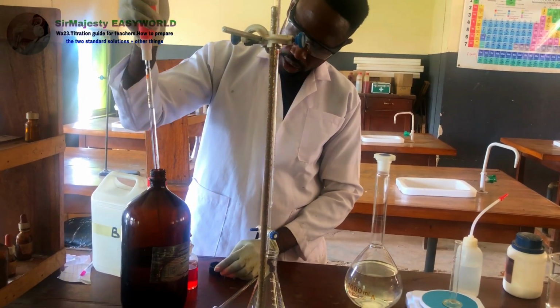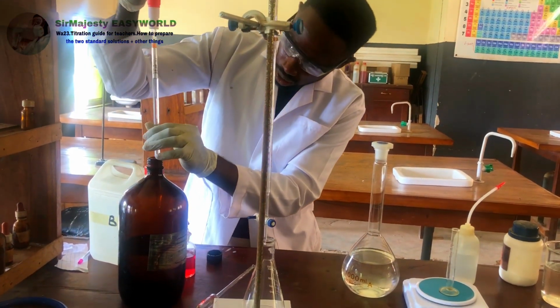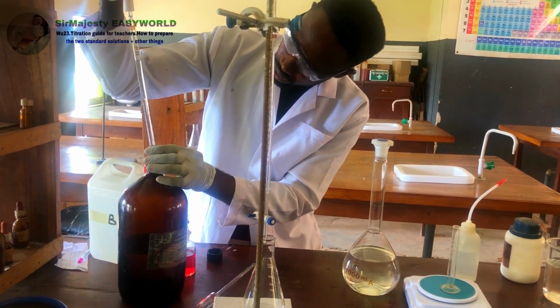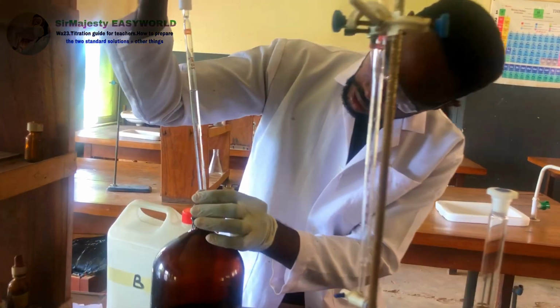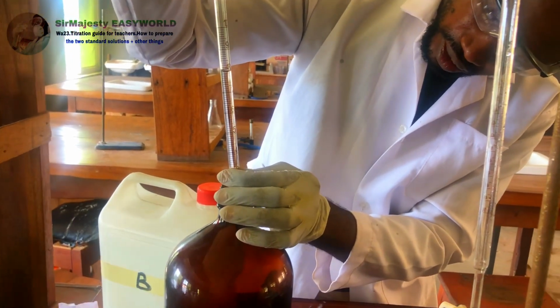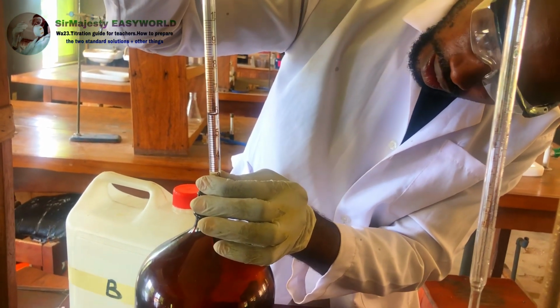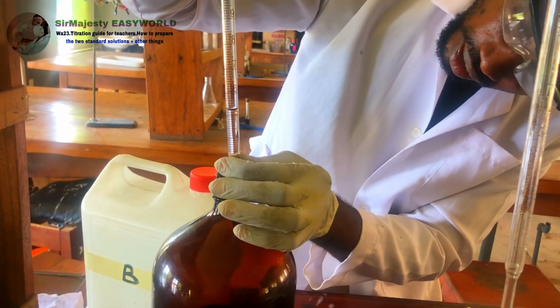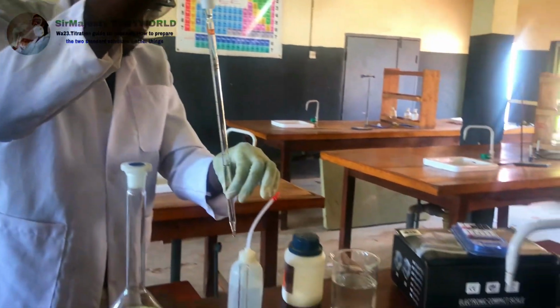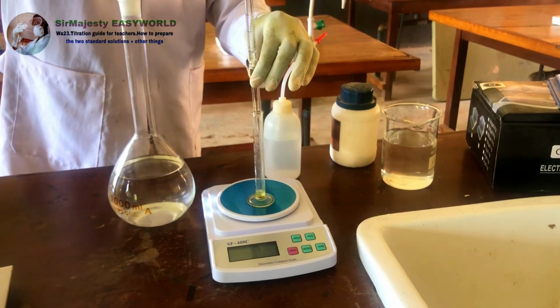There are air bubbles. I'll avoid that. This is 10 mil. I want to add 5 mil to it. So I do it in 2 ways. Let me wind down to 5. I think the reading is clear in the camera. Okay, that's 5 mil. I'll transfer the 5 mil into this cylinder and know the new mass.